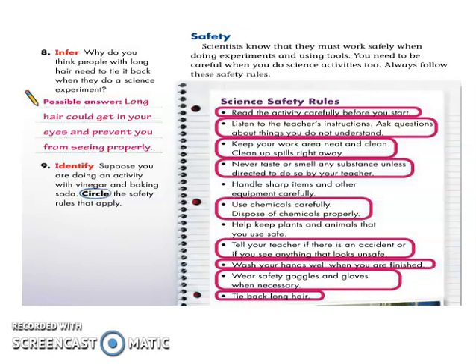Okay, so let's discuss safety. Scientists know that they must work safely when doing experiments and using tools. That is very important, because if you're not doing the experiment or the activity safely, you might have an accident. An accident is a big trouble to all of us.